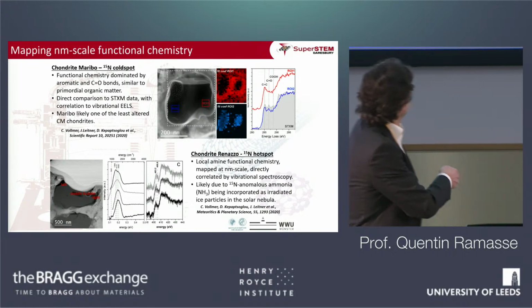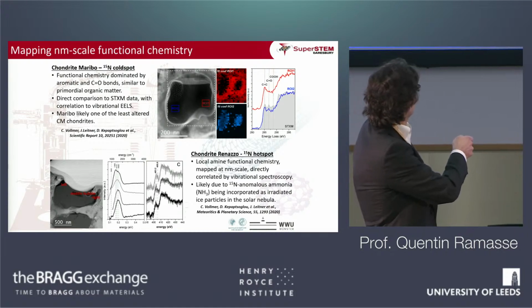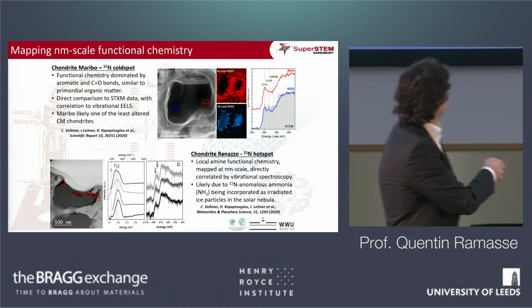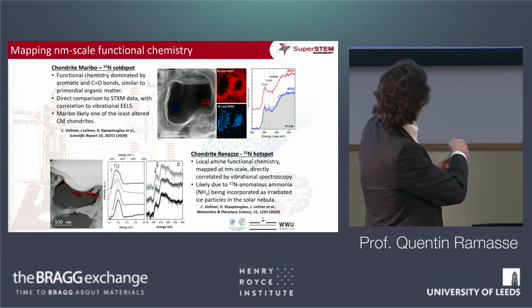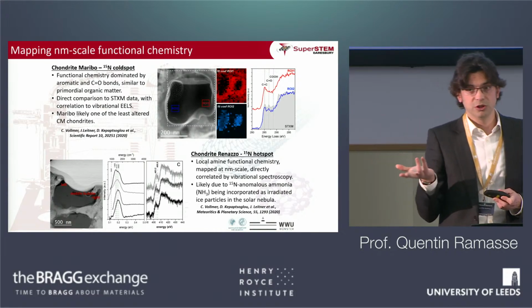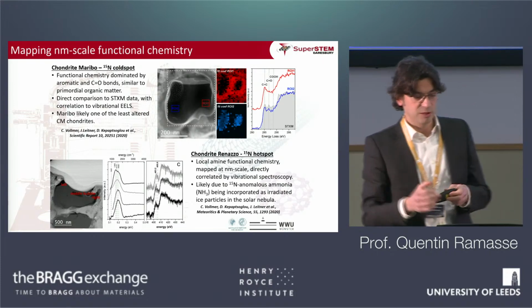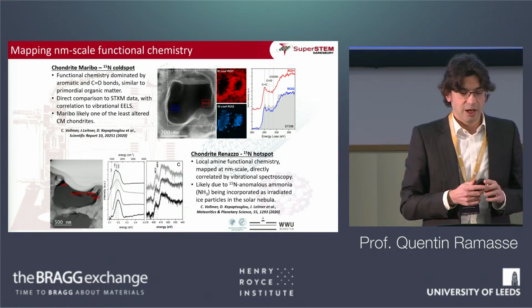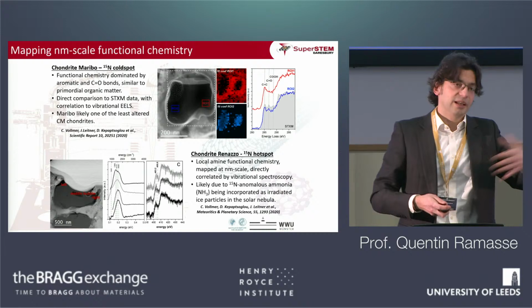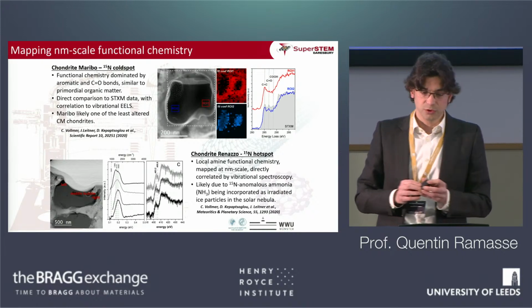you can relate this to specific absorption bands that the chemist can relate to different types of bonding, and depending on the abundance of these locally, you notice that we can make maps on the order of about maybe 50 or so nanometers. In this case, these are amorphous materials, of course, so we're not talking atomic-sized grains anymore, but nanometer-sized grains. You can understand what the chemistry of the whole thing is, and extrapolate as to how these grains have formed and how the local chemistry is formed.